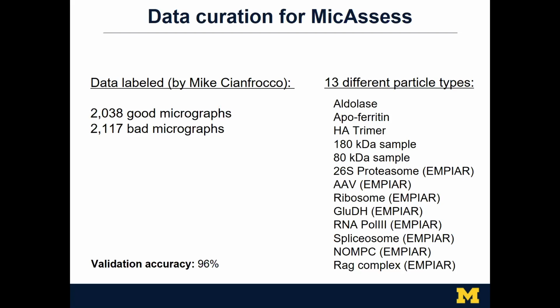The validation accuracy is about 96%. And note that in the real application, we actually tune the model to tolerate more bad micrographs being misclassified as good ones, and that's kind of the only subjective parameter in the real software that you can tune.